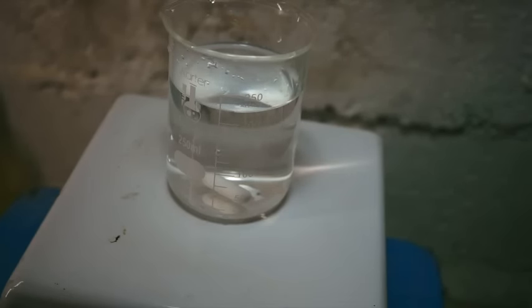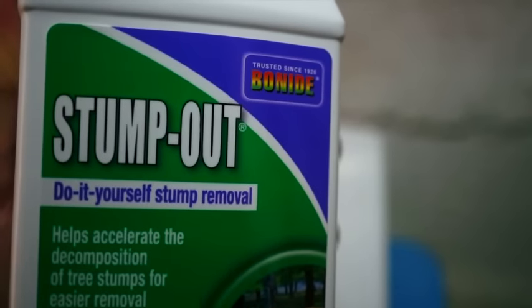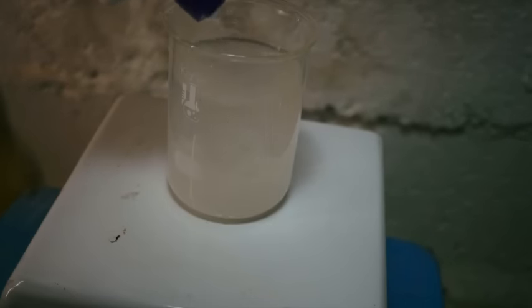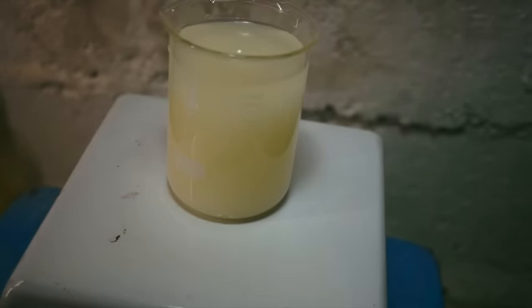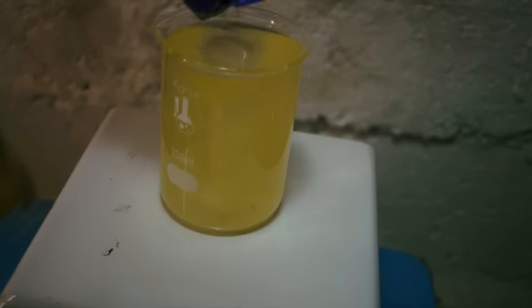Next, we will make a saturated solution of sodium metabisulfite. I purchased mine as a stump remover from a local hardware store. Keep stirring until the solution will no longer absorb any more sodium metabisulfite.